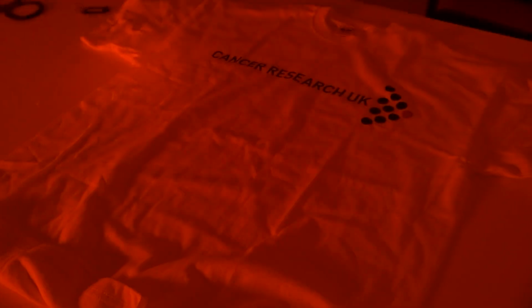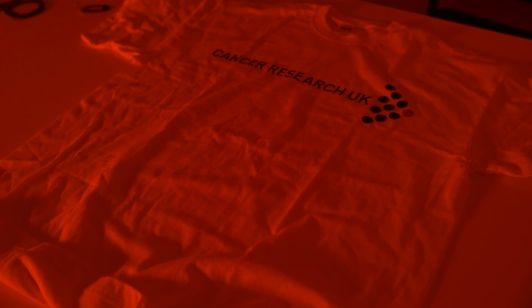So in this case, rather than just using UV or white light, I'm going to use a green light on this surface. Straight away, when we turn on the green light, we're able to see these two areas of fluorescence. These two areas can then be targeted for further testing.